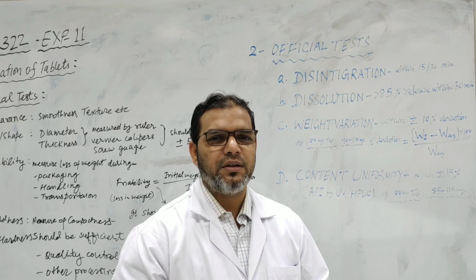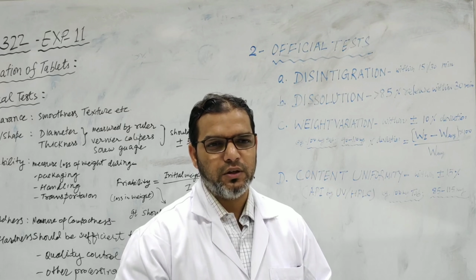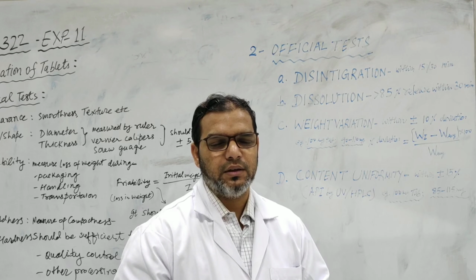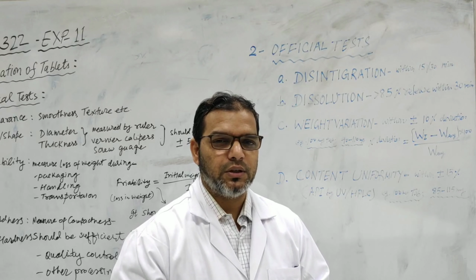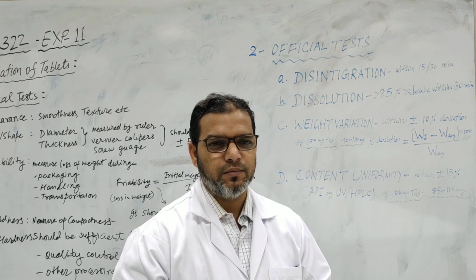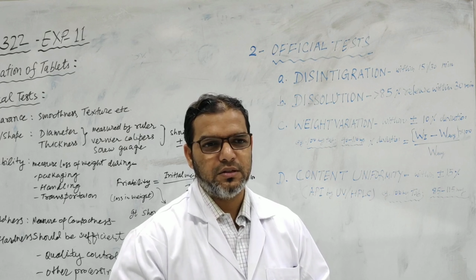If it is a modified release dosage form, it can take longer and it dissolves slowly, but still you need to do this, and you want to prepare a kind of dissolution profile, how well it is releasing over the time period which is mentioned.